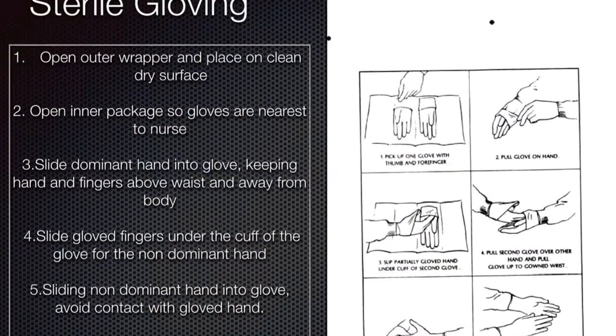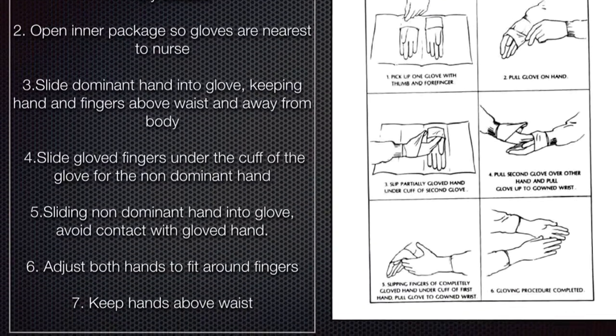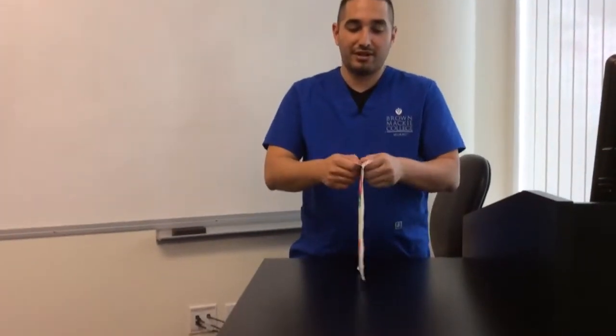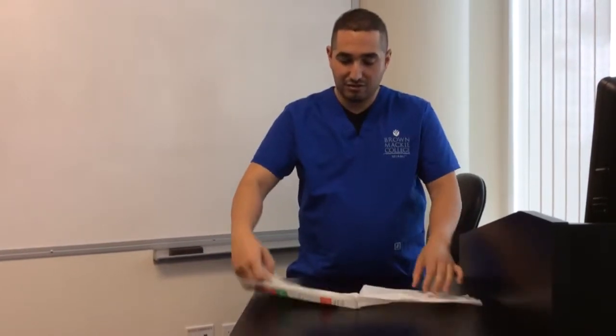Now I'm going to demonstrate putting on sterile gloves. First, have a clean, flat surface, then perform proper hand hygiene. Open the package, separating it evenly. Making sure the packaging is facing up, and open it up, making sure both sides are on the correct side. The left side gloves on the left, right side on the right.